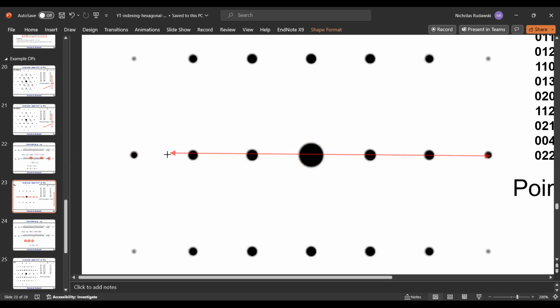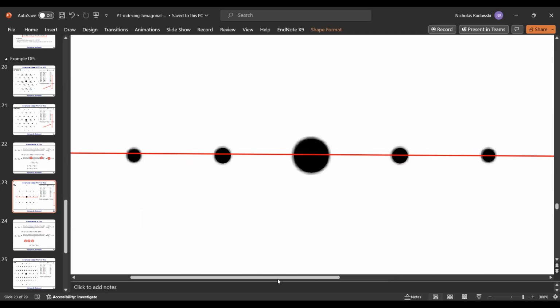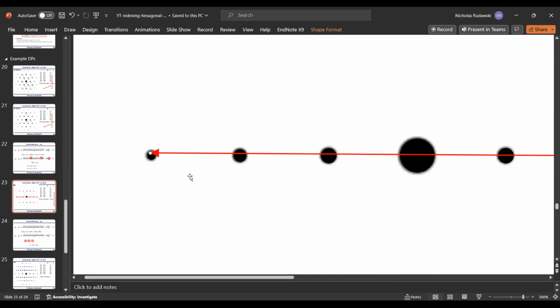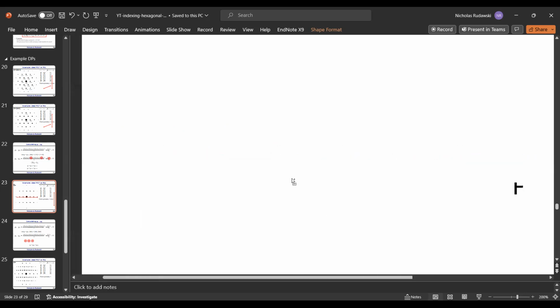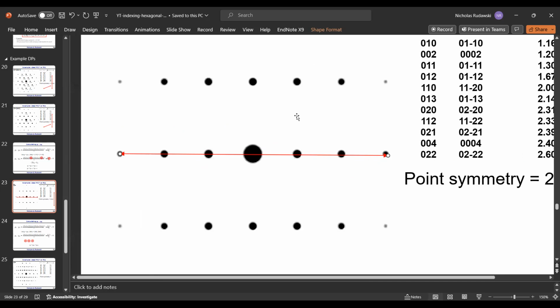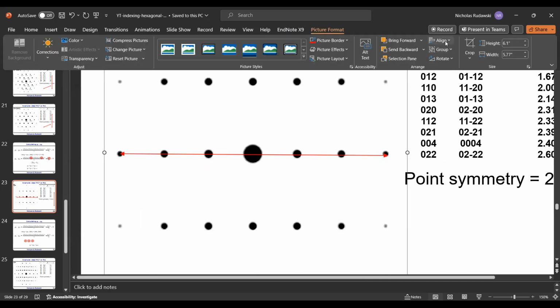I want it to stay flat. I guess it's there. Okay, there we go. Now this pattern, of course, is probably not perfectly level in terms of the spots. I think it's rotated just a little bit here, it looks like. So what I can do to alleviate that really quickly is just rotate this very slightly.